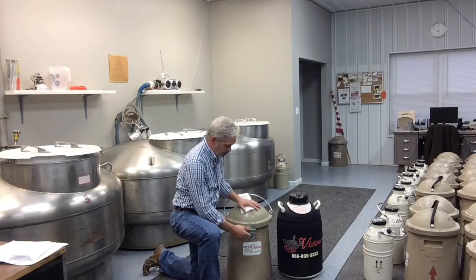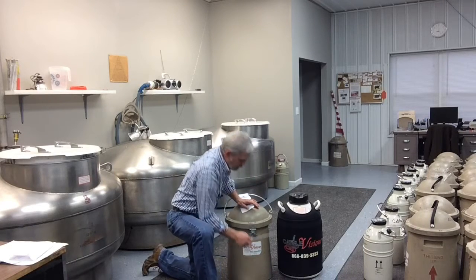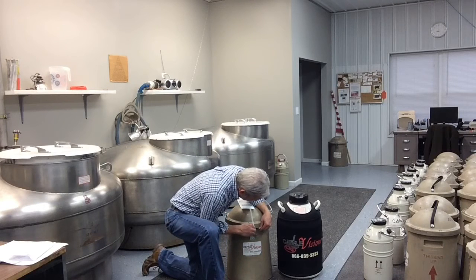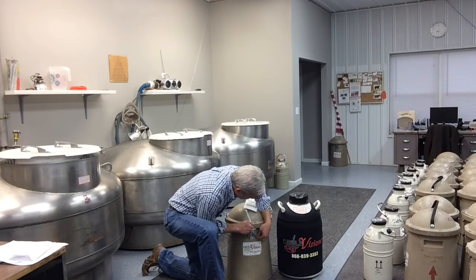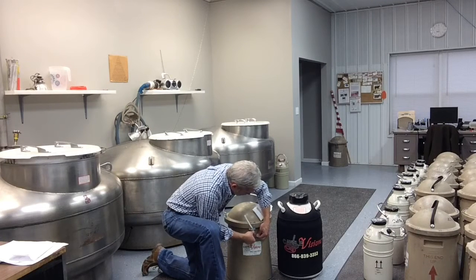Then you can close the lid on the shipper cover, make sure it's latched, and then take your large zip tie and run it through the lid and through the latch on the body of the shipper cover.